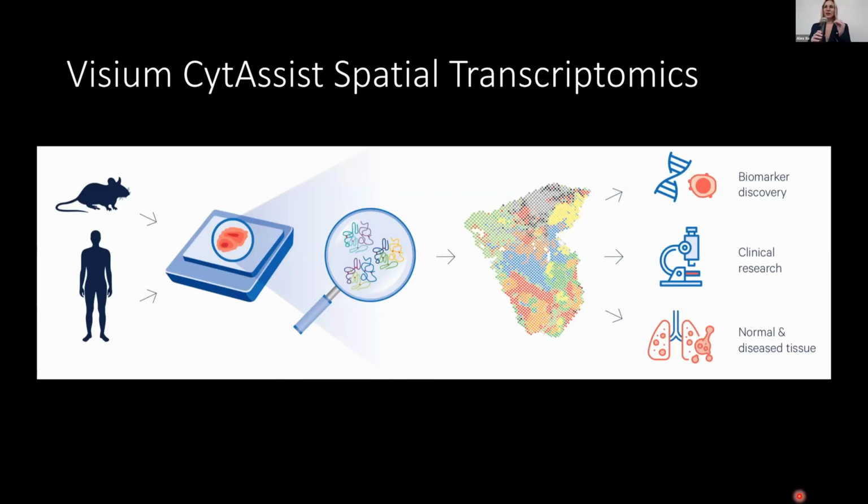So I hope I've convinced you that looking at these extremely small samples that are very, very rare to get would benefit tremendously from being able to understand some of the genes that are expressed during this window of time, that can help us with our in vitro differentiation strategies, but also potentially help the field of differences in sex development, where the majority of cases are undiagnosed. And so what they do need is new biomarker discovery in order to have new candidate genes in the sequencing approaches of these individuals. So what we decided to use was the Visium CytAssist spatial transcriptomic technology.